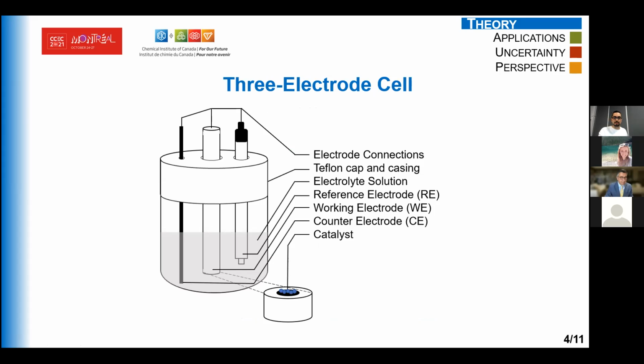And just now to introduce a 3-electrode cell. A 3-electrode cell is needed for cyclic voltammetry experiments, CV experiments. In this case, we need a working electrode, a counter electrode, and a reference electrode. The working electrode is the electrode of interest, where we want to measure and control its potential difference, and this determines the properties of the material.